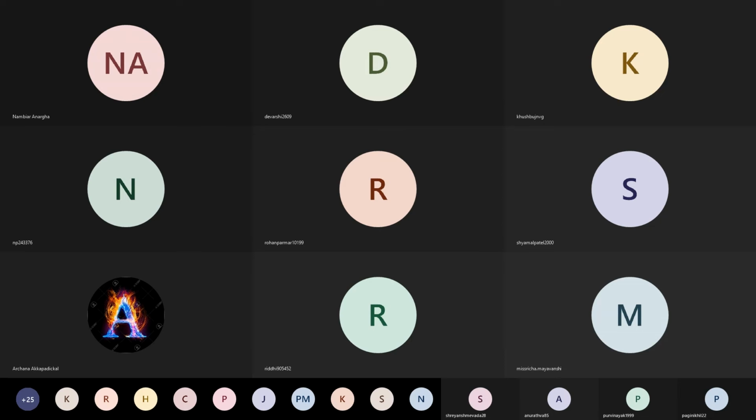Why can't we visualize it in any other chamber, or can't we use a UV chamber? Then the categories of the drugs under study, that is domperidone and omeprazole, which category do they come under? Then, why does it show blue color when ninhydrin and amino acid react, why do we get blue colored spots?